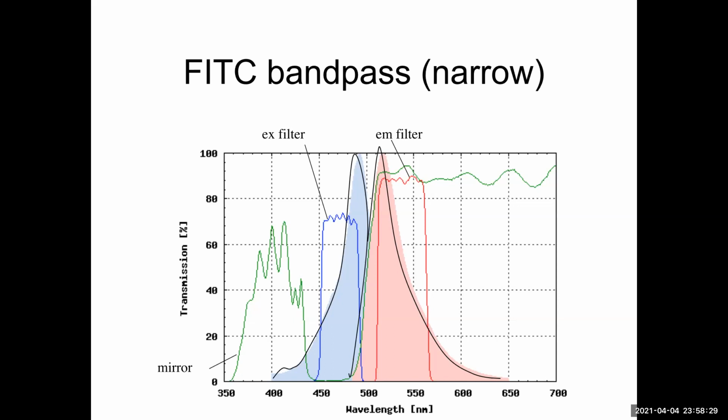In both cases, the x-axis is the colors of light, visible light. That's easy. What about the y-axis? Well, actually, it's the same story. The filter set selection is what's noted there, which is how much light is transmitted. In the case of the spectra, it's sort of the same thing, because we're talking about how much light is there.